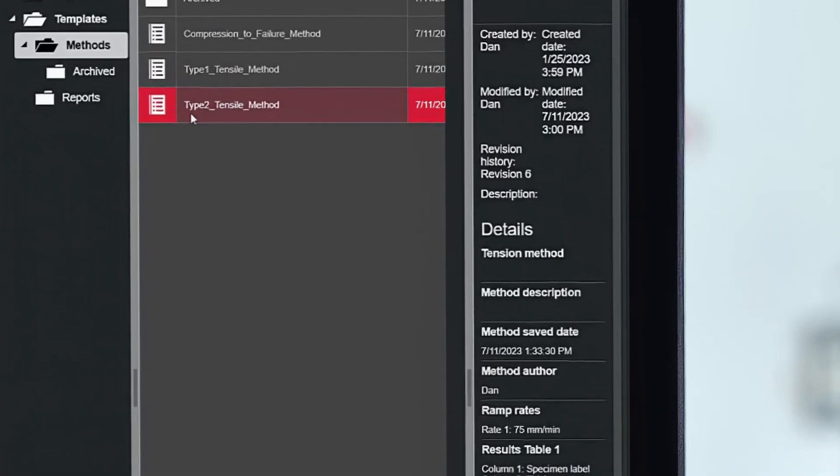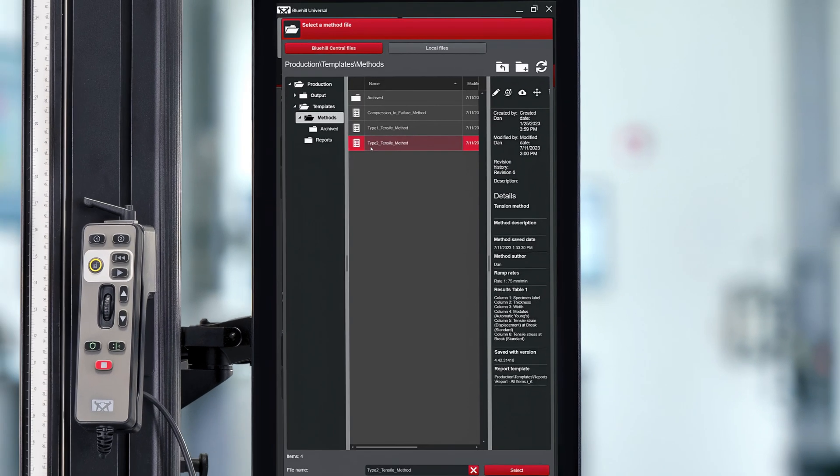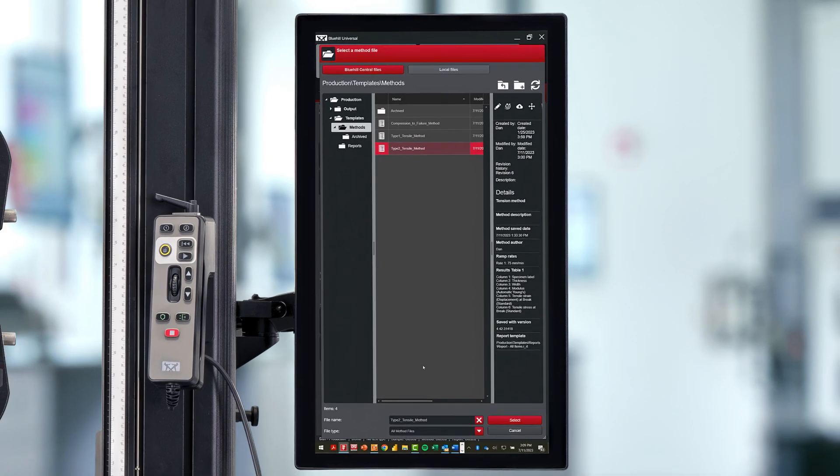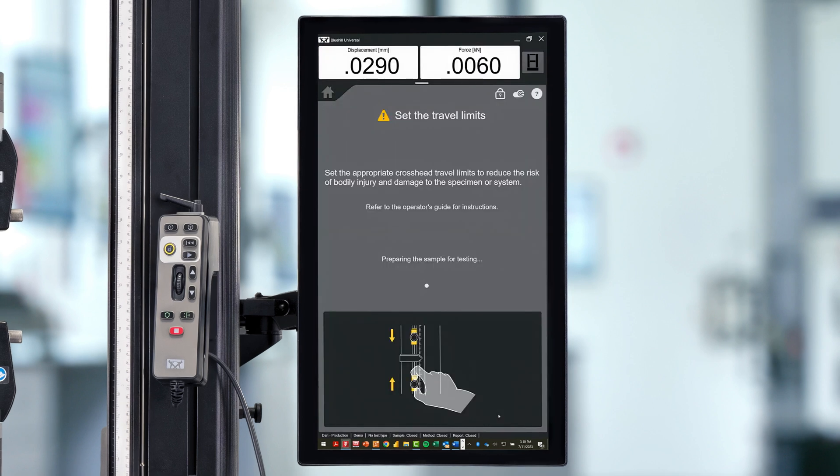The database always shows the latest revision of a file, so your operators never have to worry about selecting an outdated or incorrect method.